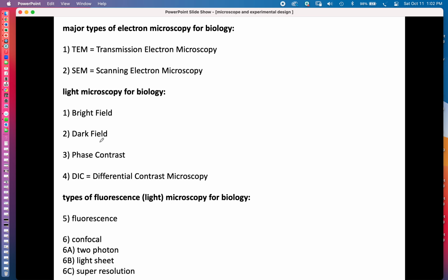11 different types of microscopes. And I'm going to ask you as your assignment to pick 5 of these and learn more about them. Save whatever website links you use as sources to make a bibliography. And for each of the 5, write a separate paragraph that describes again how this method works a little bit, and then an example in biology of when this method would be used.